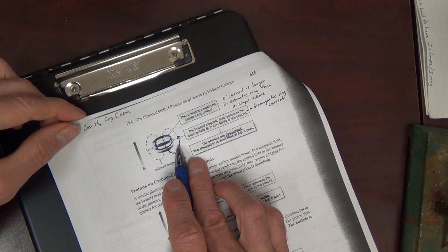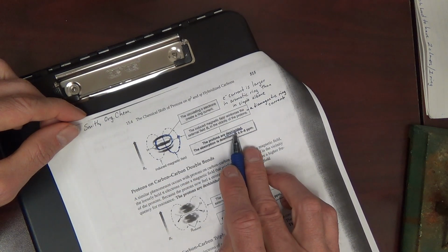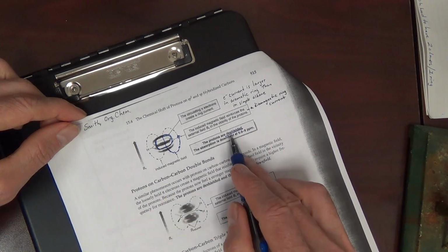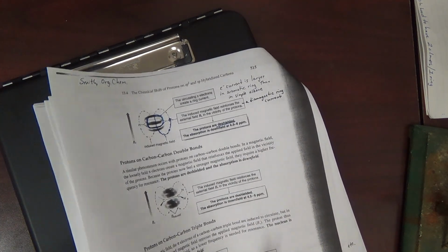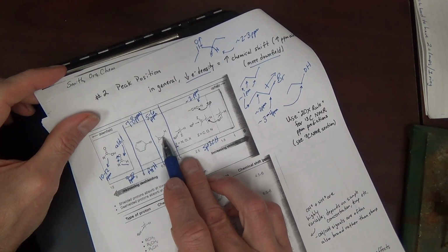Sunscreen shields, but if you put something on that does the opposite, we would call that de-shielding. And de-shielding we know is going to move the signal towards the left, more downfield. And that's the reason why your aromatic hydrogens are more downfield than your alkene hydrogens.